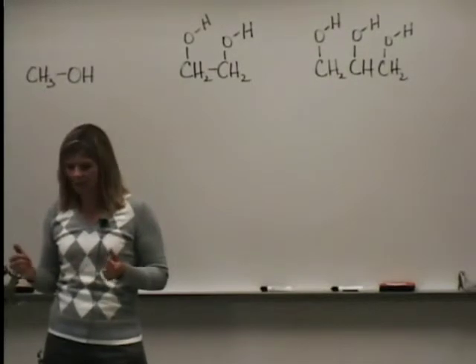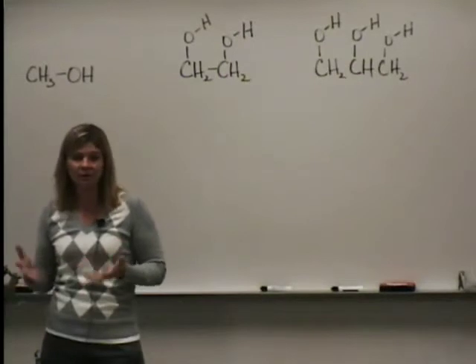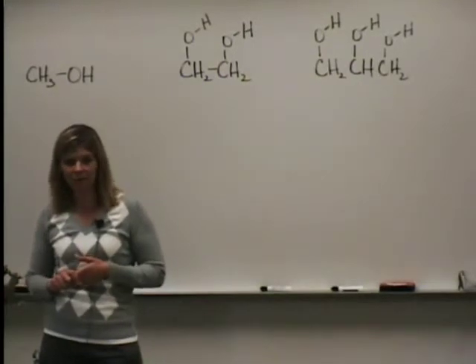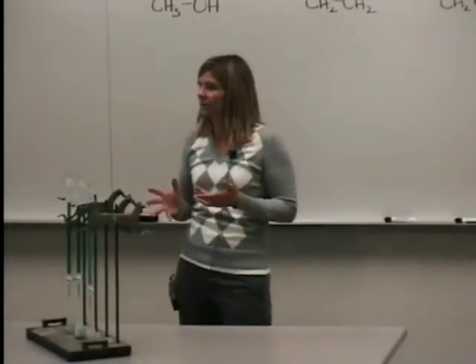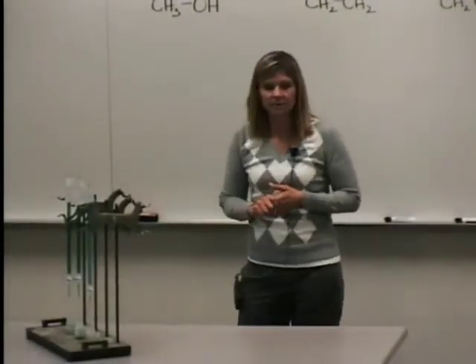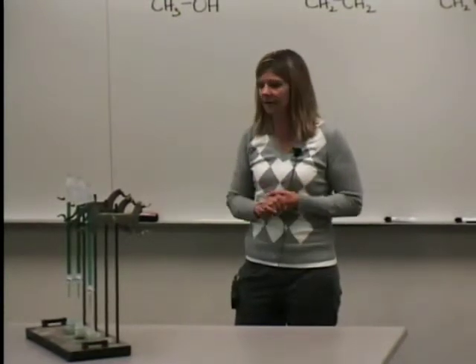So today I want to show you a demo that illustrates some of the intermolecular forces that we've been talking about. Viscosity was one of those properties that we think is associated with how strongly attracted molecules are in a sample of any given substance.